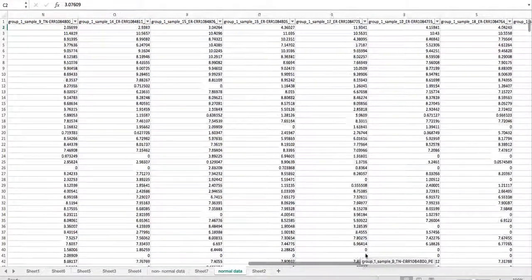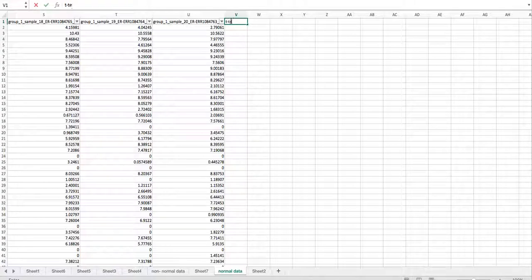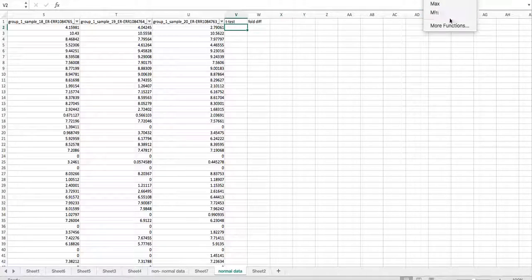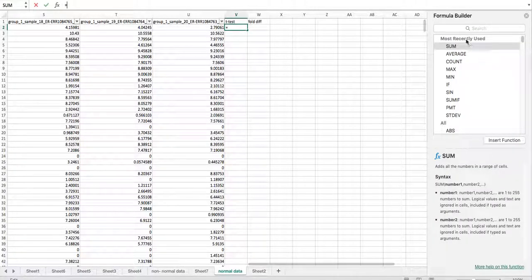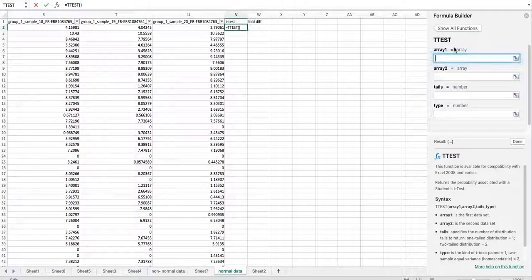We're going to go to the t-test up here and fold difference. So we want to analyze our t-test — go to where all the functions are, go down to more functions, and search for t-test. There we have our first array.